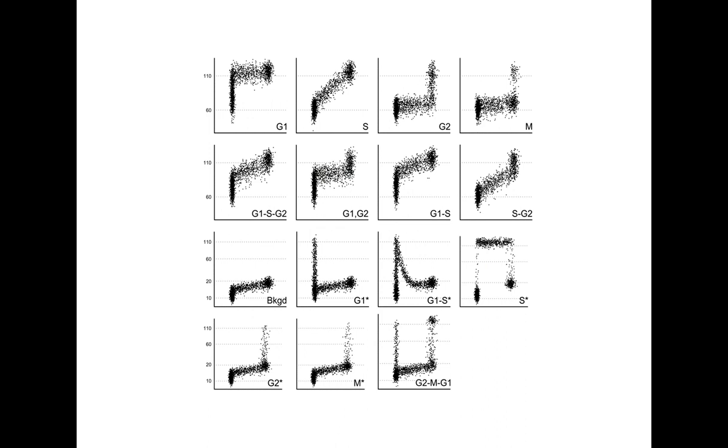The upper row contains expression that rises and plateaus within a single phase. The middle row shows expressions that rise across phases. In both rows, cells divide at the plateau level, creating daughter cells that have half that level.